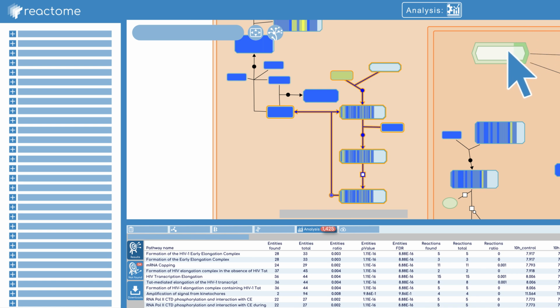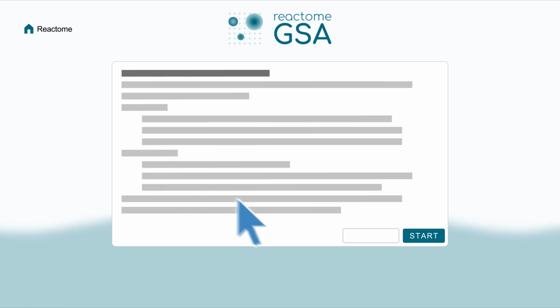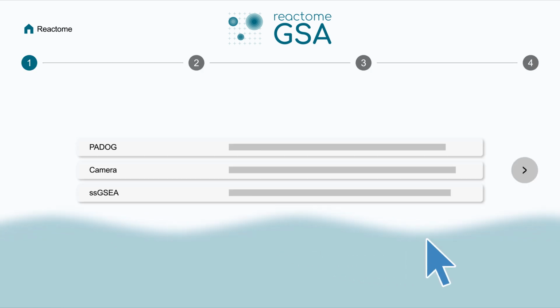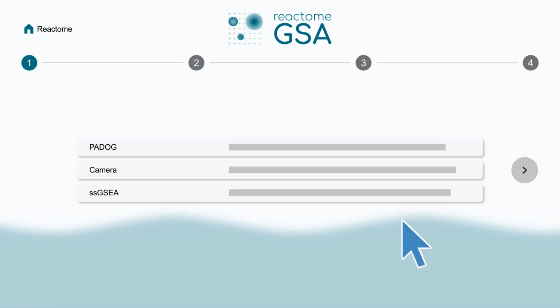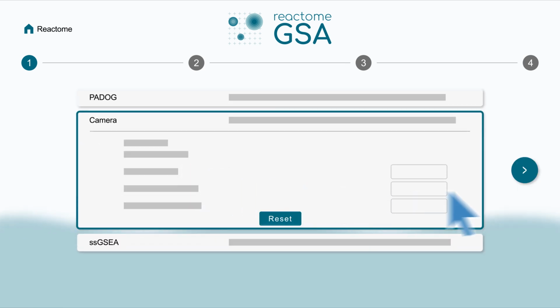If you want to perform quantitative data analysis using your transcriptomic or proteomic data, we also have a suite of advanced tools like Reactome GSA available, which you can reach by clicking on Analyse Gene Expression. Reactome GSA, also known as the Reactome Gene Set Analysis Tool, provides you with multiple analysis methods, such as camera, and allows you to upload your own data.